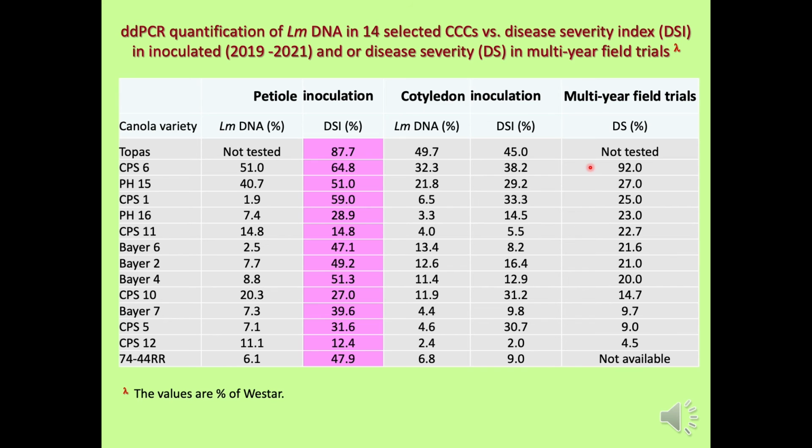The susceptible, resistant, and highly resistant reactions were well reflected by the cotyledon inoculation in both ddPCR quantification and also inoculated field trials based on the disease severity index.